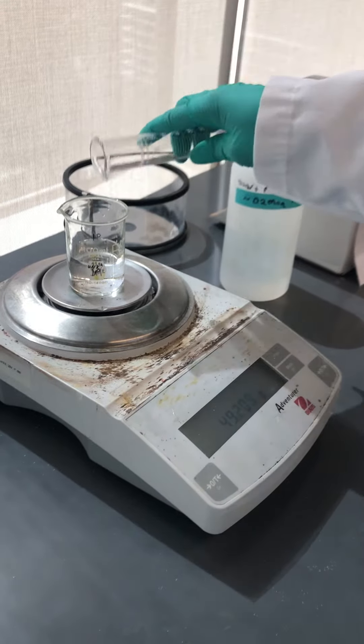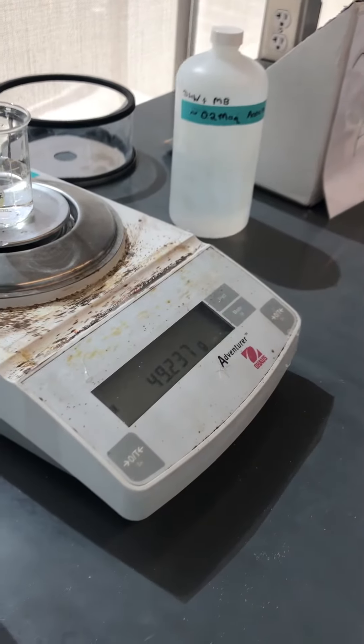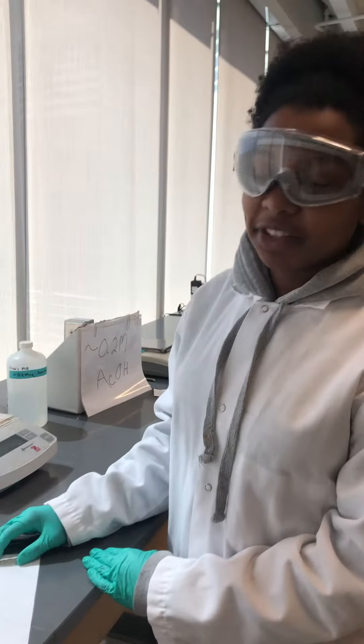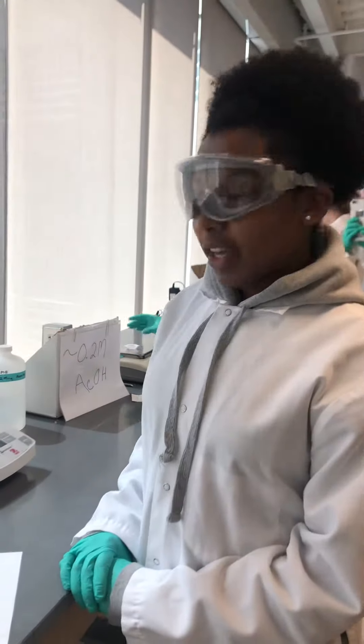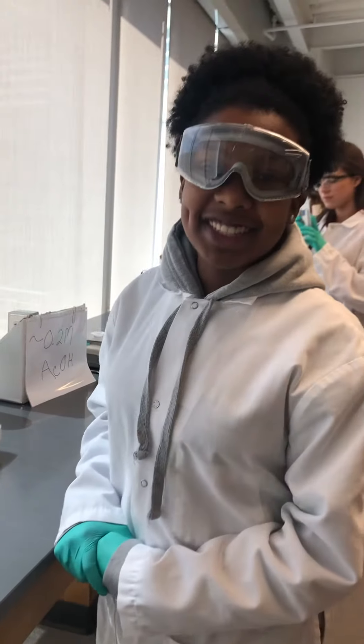So that is now 50 milliliters of water into the beaker. And because we tared the empty beaker, this is the mass of 50 milliliters of water. So 49.237. And we would keep those five sig figs because that is what our scale tells us.